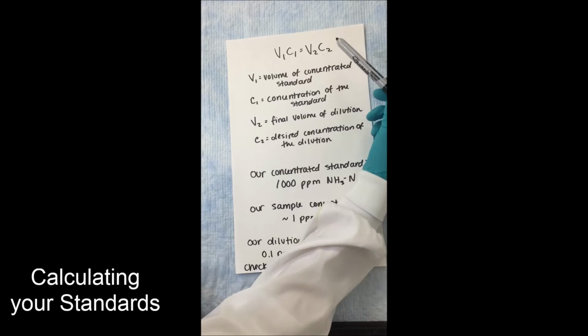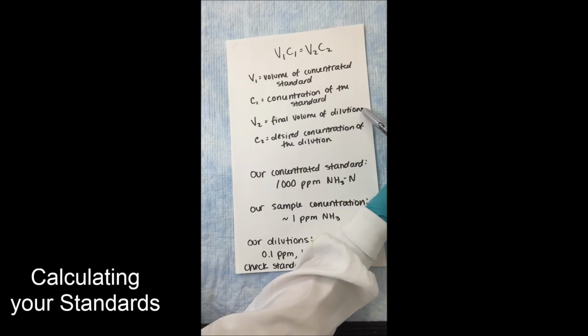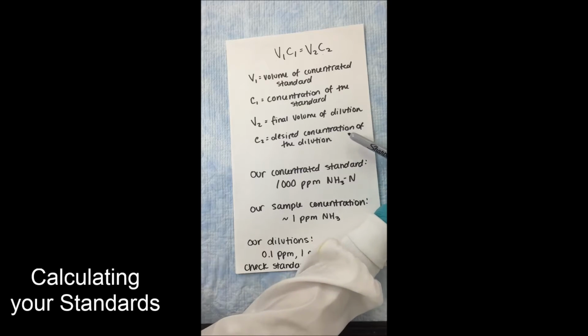First, we're going to start out by calculating our standards using V1C1 equals V2C2, where V1 is a volume of concentrated stock solution, C1 is a concentration of the standard, V2 is the final volume, and C2 is desired concentration of your first serial dilution.